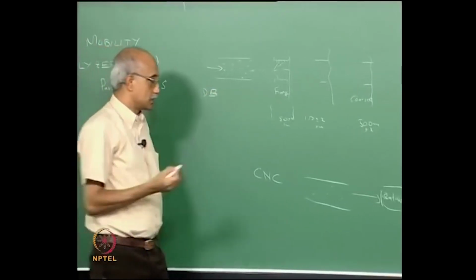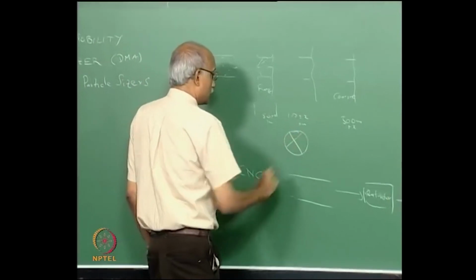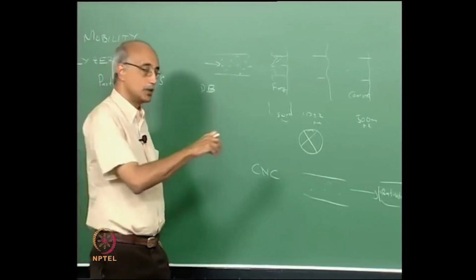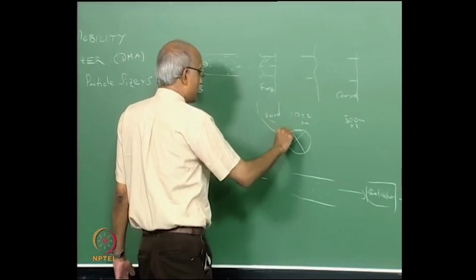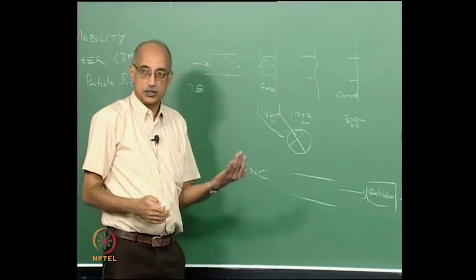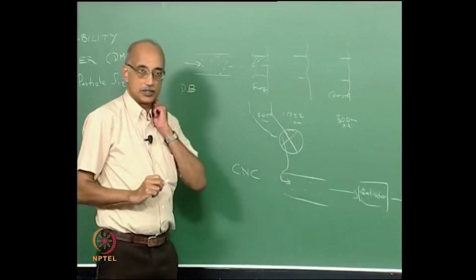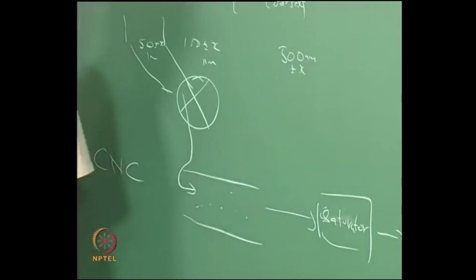So, the way this works is essentially you have a valve here which will be set to successively accept the output from each of these cells. Initially this valve will take in all the particles that are captured in the first mesh, and that will be input into the condensation nuclei counter, and the counting will be performed.